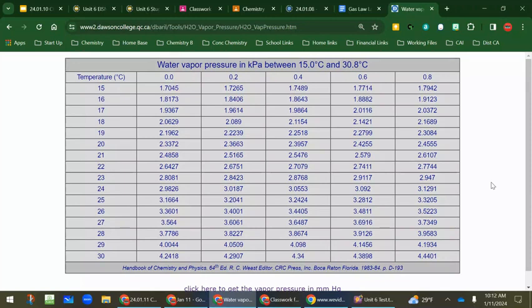By the way, ladies and gentlemen, what can change during the day for this lab? The pressure. So please, if you have a friend who's in 3rd hour, don't think they're going to use 98.84. That may change by then.